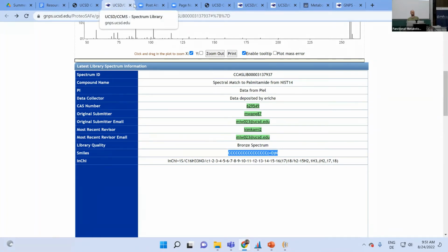All right, another question? Yeah, so let's change the settings to optimize it for our data. What is the criteria based on which you decide that this is optimized? That's a good question. I don't have a straightforward answer for that.